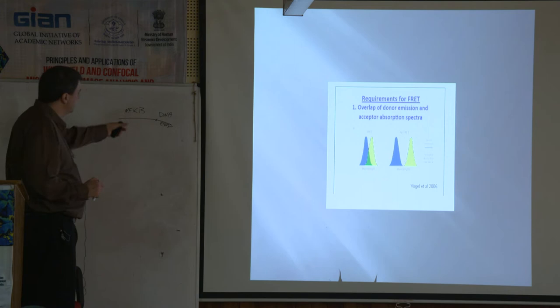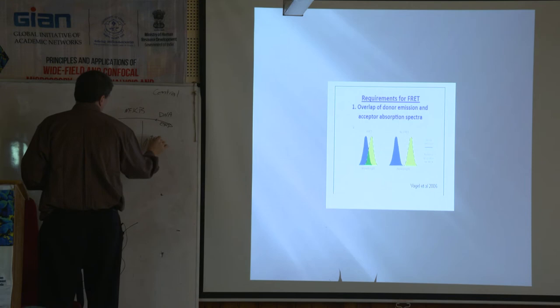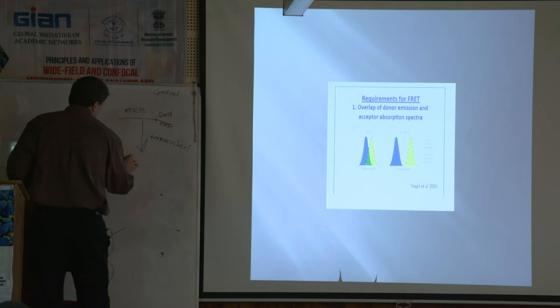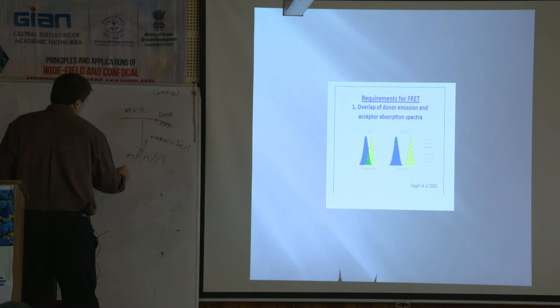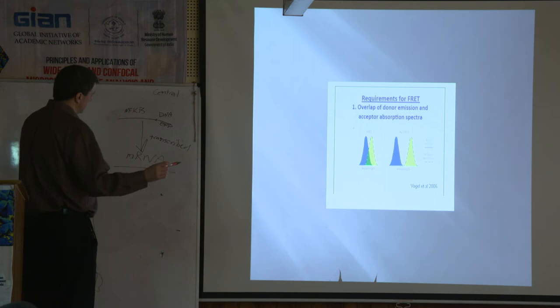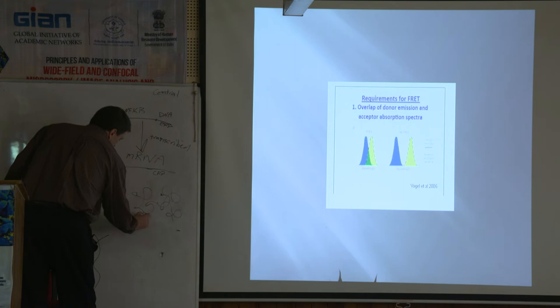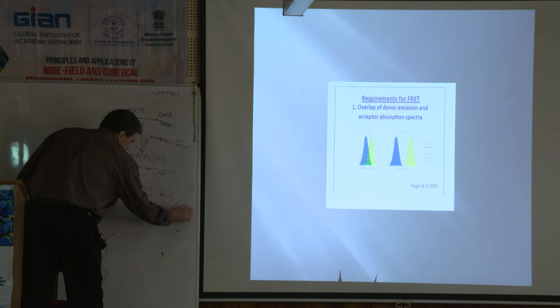So what happens? You take DNA, like we learned the central dogma of biology, right? DNA gets transcribed into a messenger RNA. And that messenger RNA is a hybrid. It has the signal for NF kappa B. It has the signal for CFP, but it's all one message. So the protein that's ultimately made is a protein, right? The three-dimensional structure of the protein, where a big chunk of it is NF kappa B, but it also has CFP attached to it. And that's our fluorescent molecule we use.